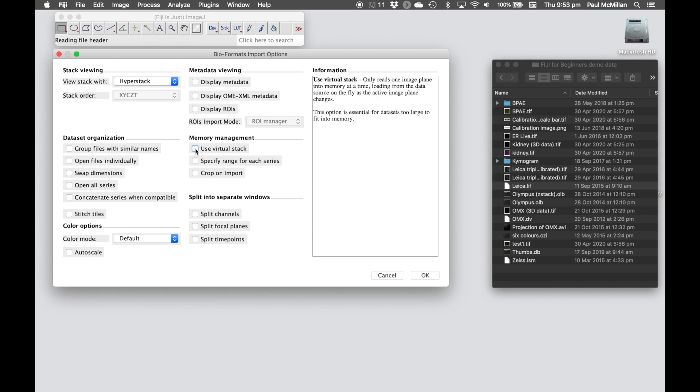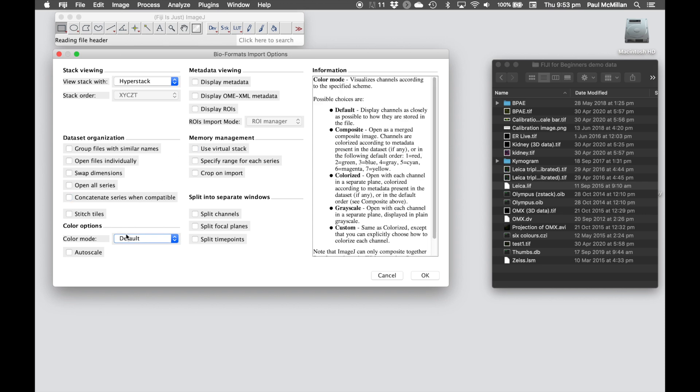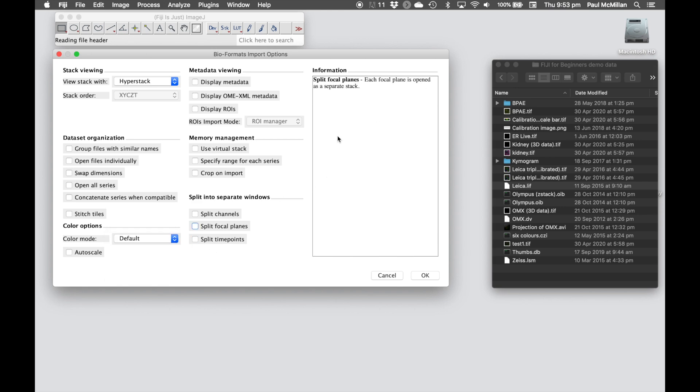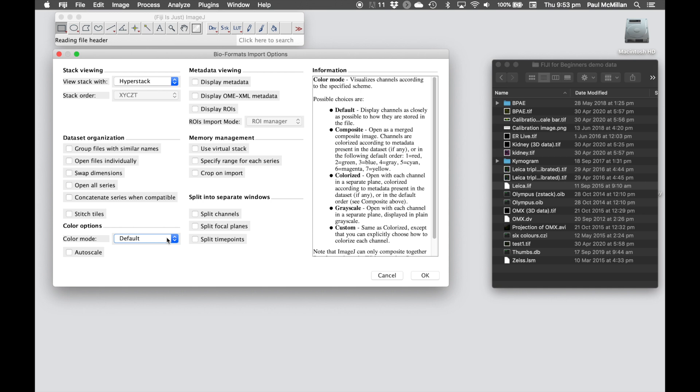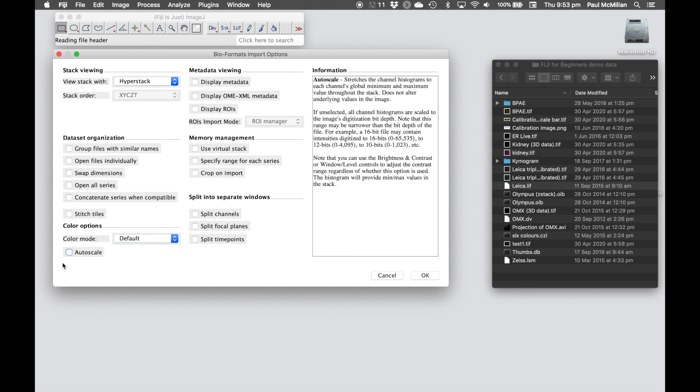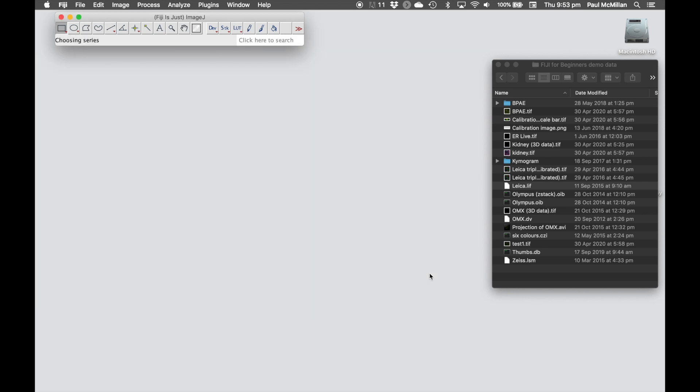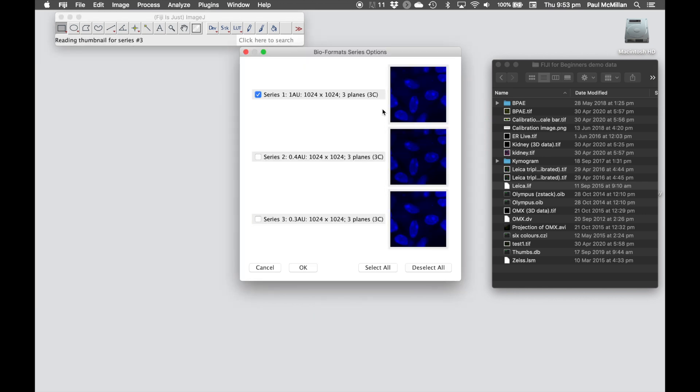We have color mode down here, so we can change and customize different color modes. You'll see every time you select something on the right, over here there's an information pane that tells you a bit more information about it. One other thing to be wary of is this autoscale button. If we activate this, it's going to autoscale the intensity scale, so it's going to change the data. Make sure this is unticked if you're doing quantitative analysis.